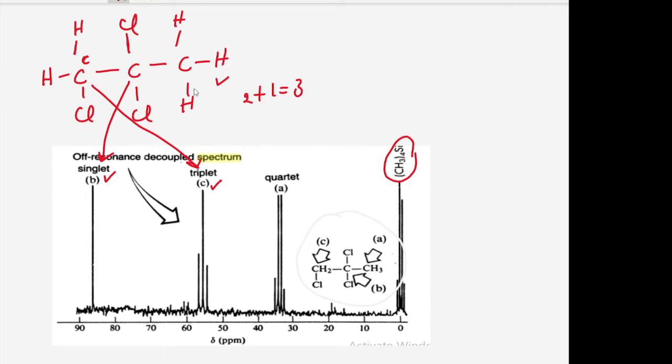Okay, so last, this is the third carbon. This carbon is attached to 3 protons.